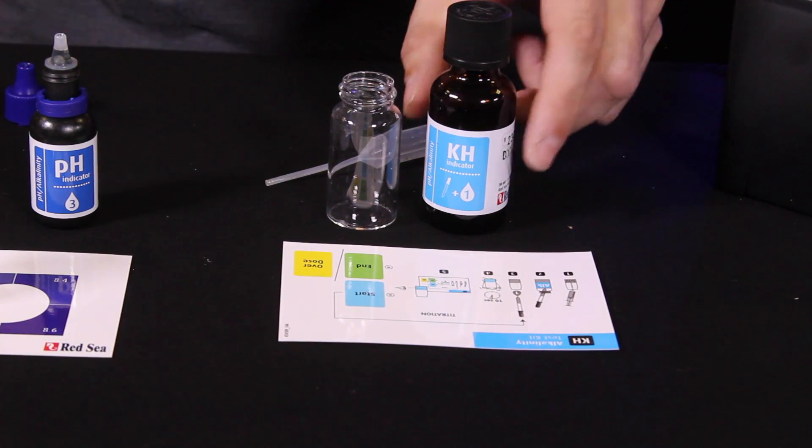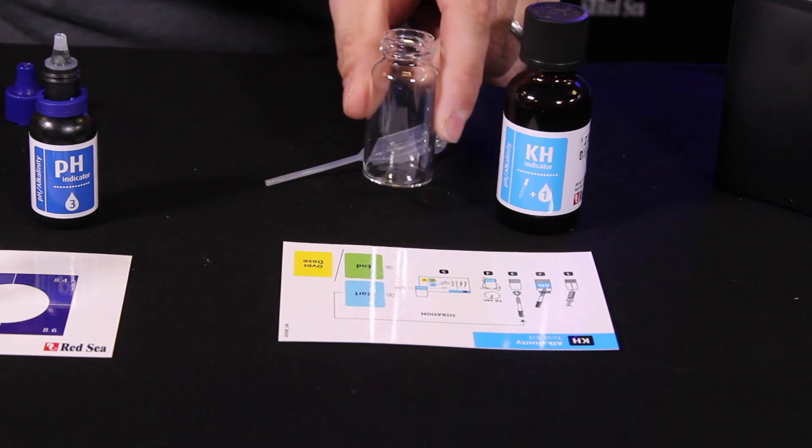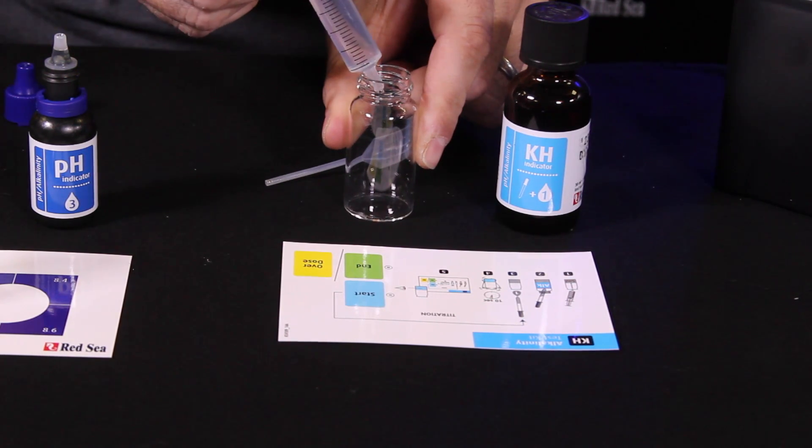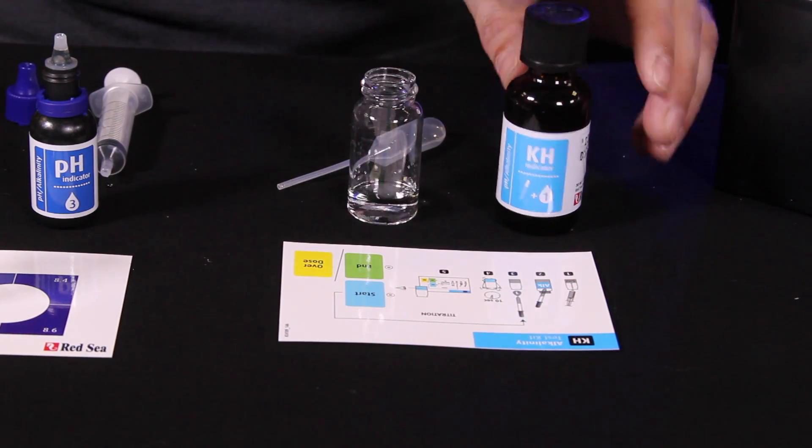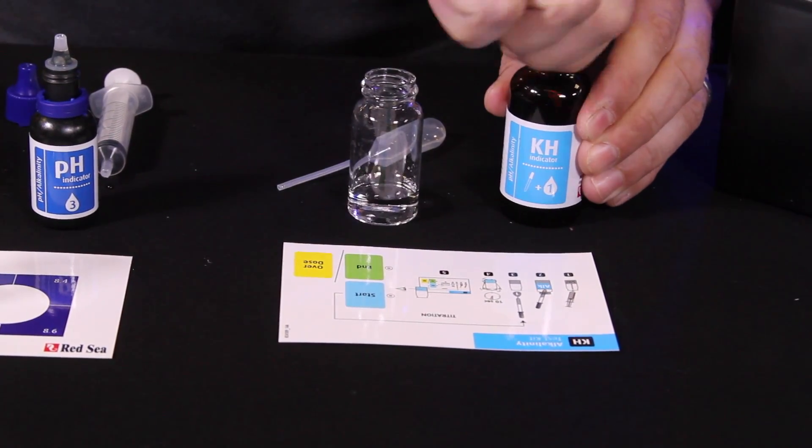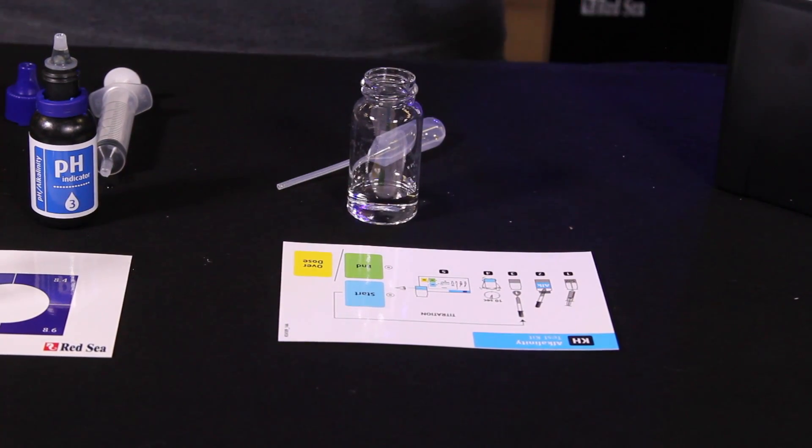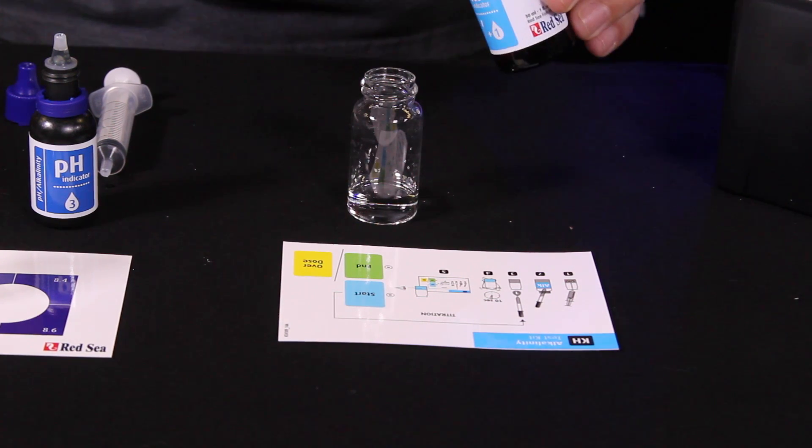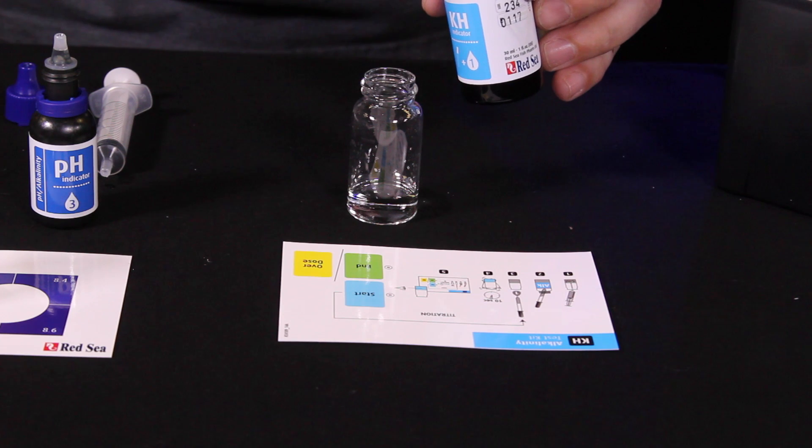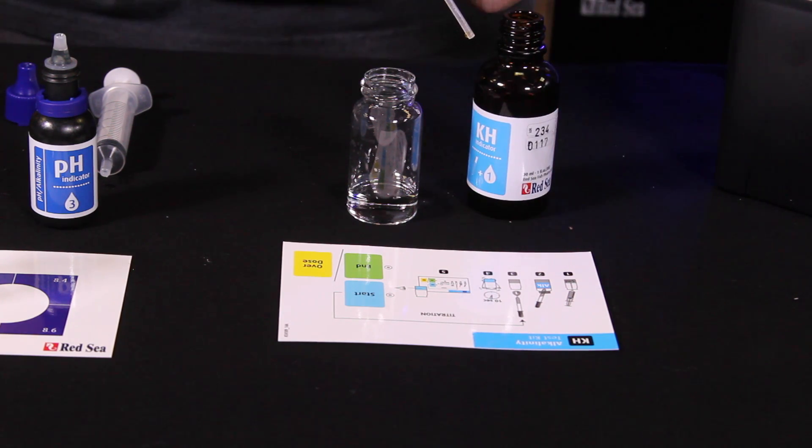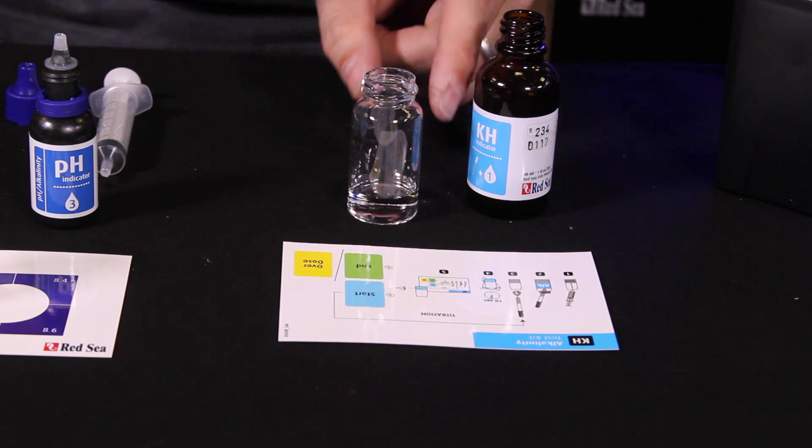All right, now we're going to do our alkalinity test. This is a titration test where you start by adding five milliliters of our sample water to the solution. And then we're going to draw up the reagent into a dropper. And what we're doing here is we're counting the number of drops it takes to get a color change. Now here you'll see the vial is a little bit empty, so I want to make sure I get even drops in there. So we're going to start with one.